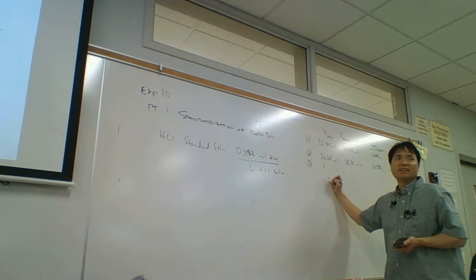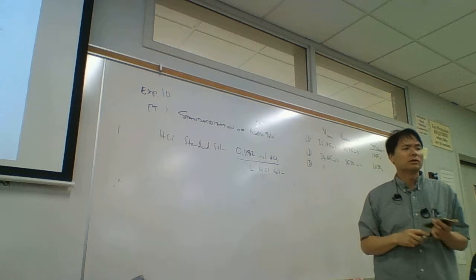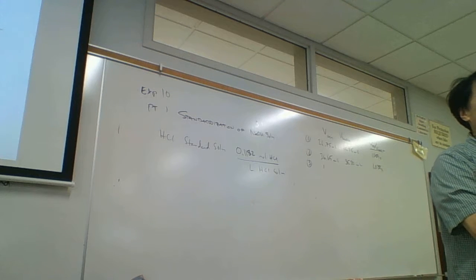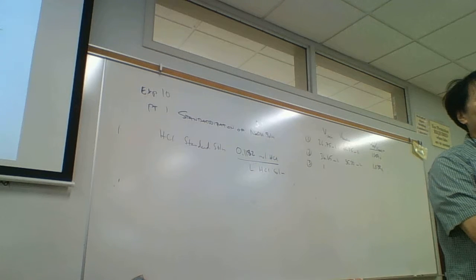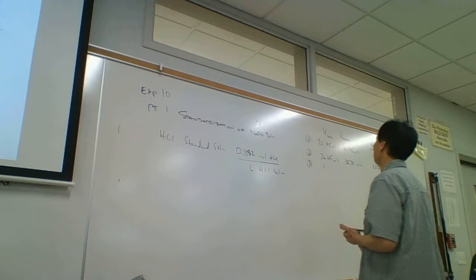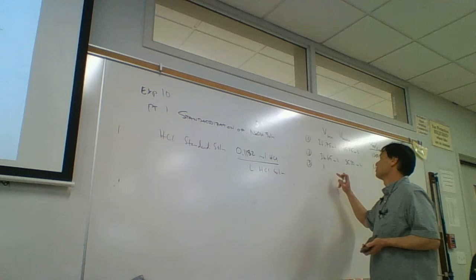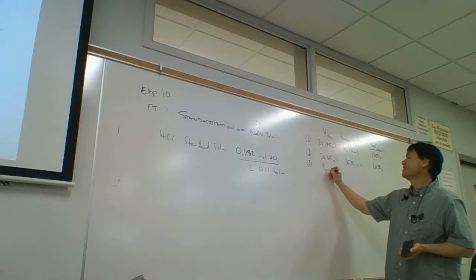1.70 can't be. A buret can only be read to the nearest hundredth. Was it 1.70? Oh, okay, so I got 9.7 for trial 3. I subtracted the initial reading of the acid from the final reading, and it came out to 9.7? Yeah. Okay, that's a little small.